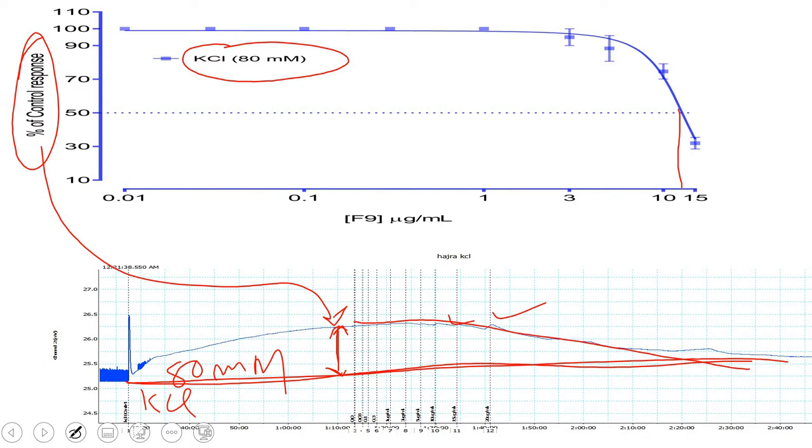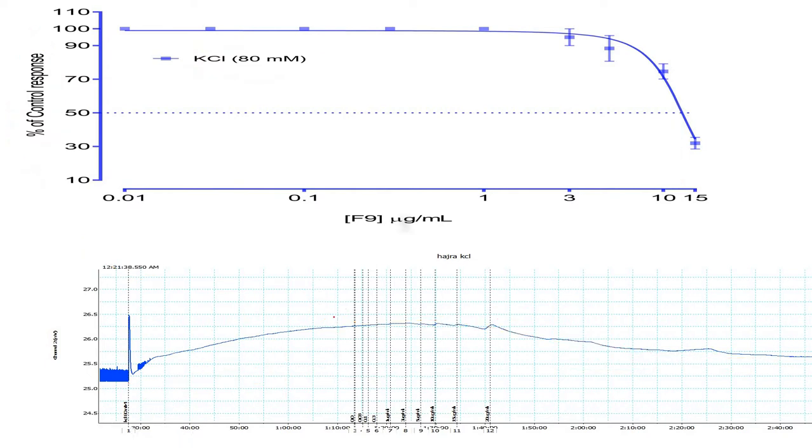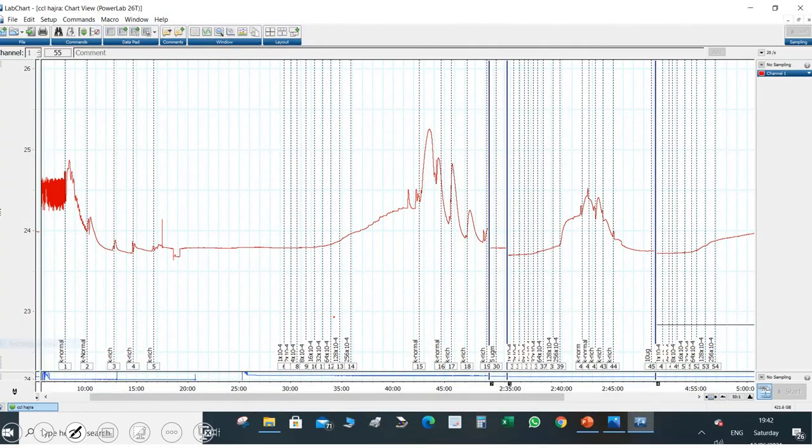So we have discussed that. We are not going to spend much more time on this. Now, since the molecule possibly has a voltage gated channel inhibitory response, how? That's because the studies tell us that if a molecule has a relaxant response against high molar potassium chloride induced contraction, it is expected to have voltage gated calcium channel blocking activity.